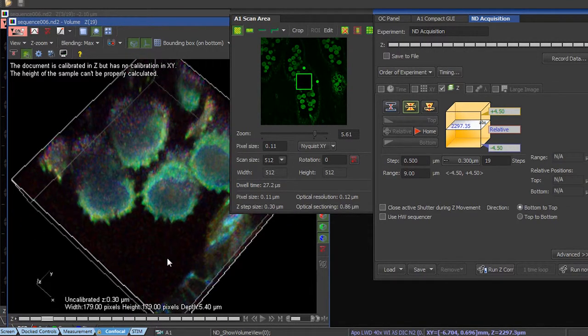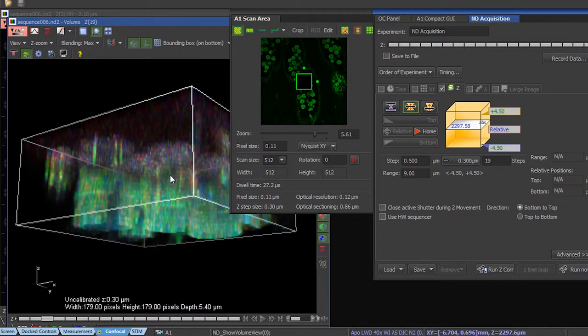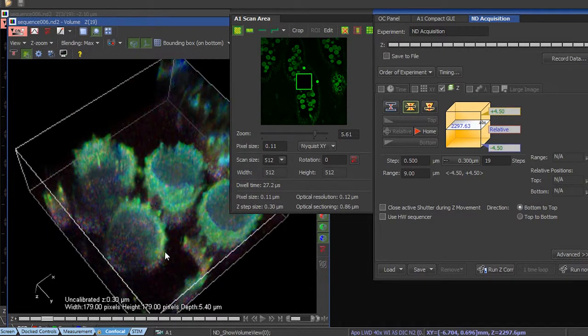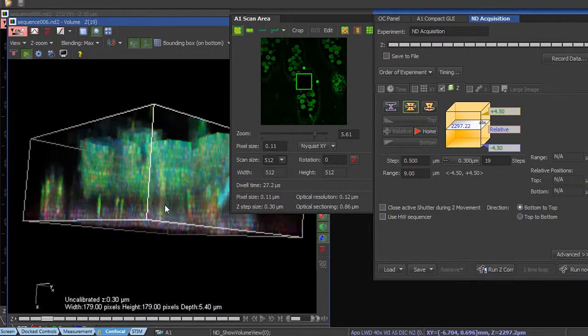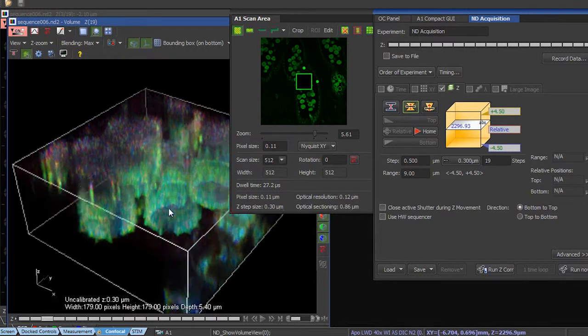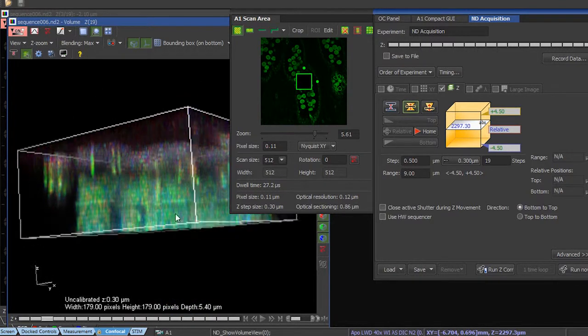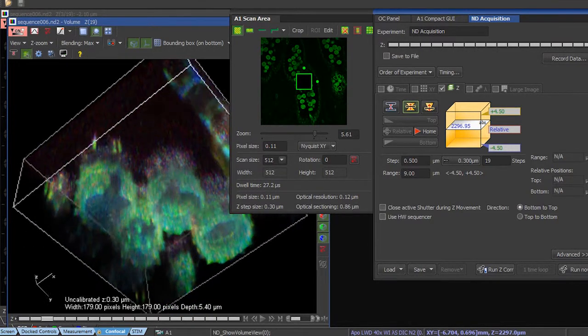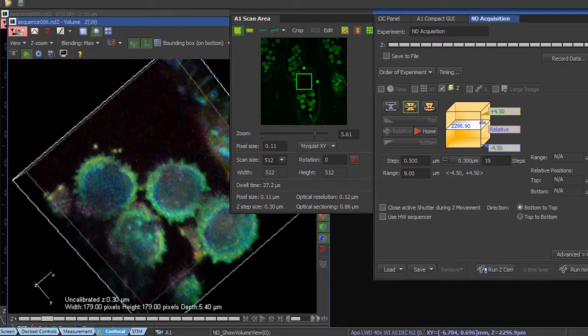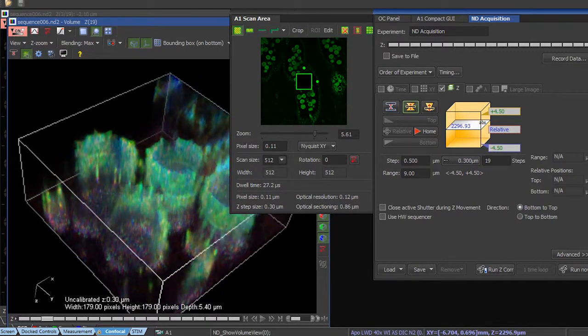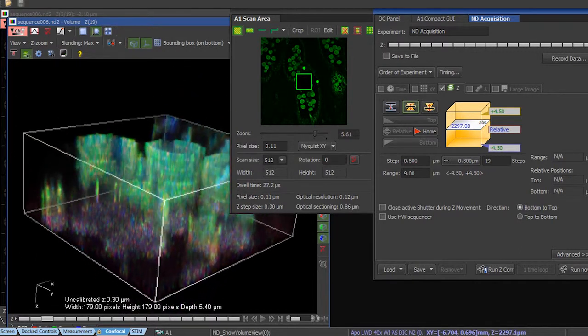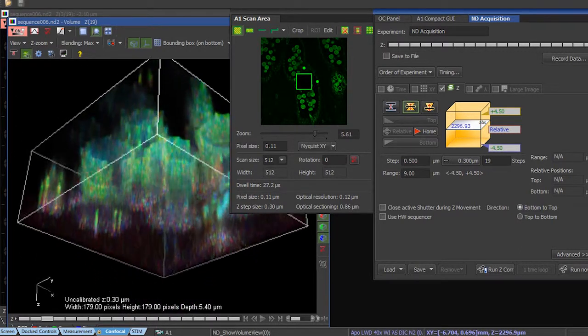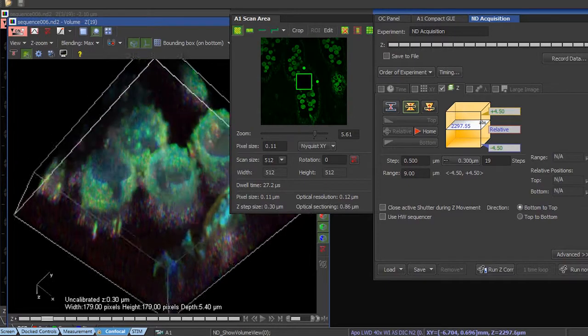Maybe in this case, the image is a little bit blurred. If you want to have a better one, then the only thing we need to do is to collect for more time. Instead of having, for example, 5 frames per layer, we can increase this number to 15 or 20. And then we can gather an image like the one we show in the video, 3D stack of a daisy pollen.